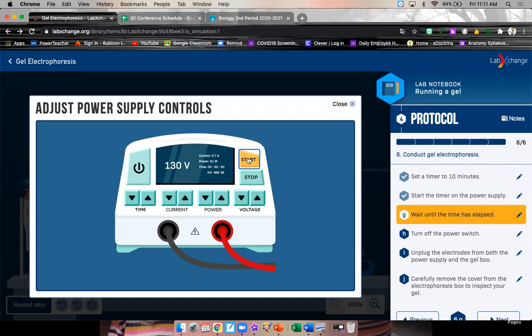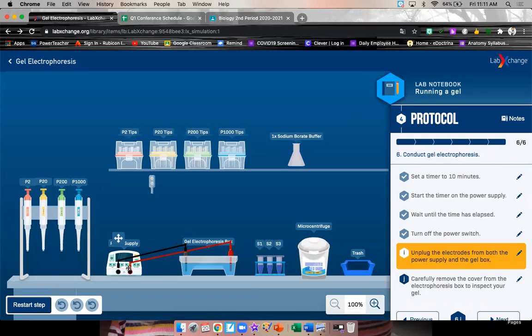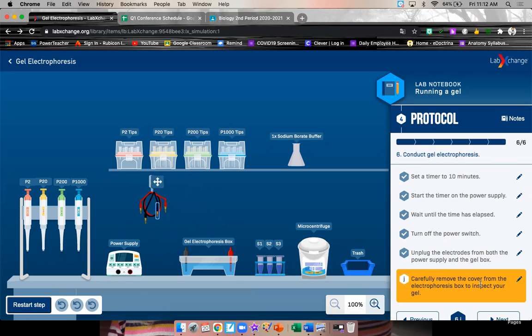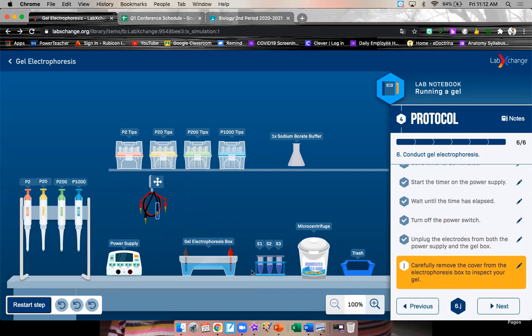In the real world, this would be a full 10 minutes. All right, and now turn off the power. Unplug the electrodes from the power supply and the gel box. Carefully remove the cover from the gel electrophoresis box to inspect your gel.